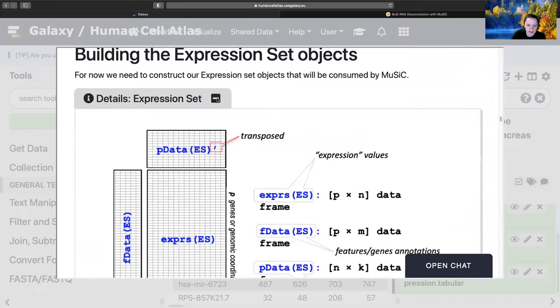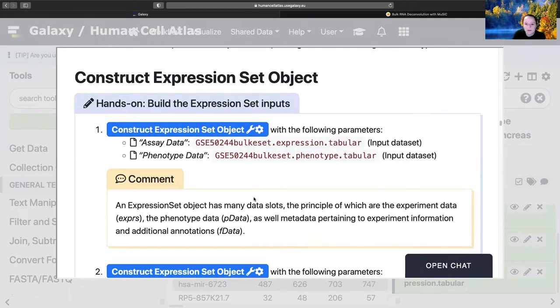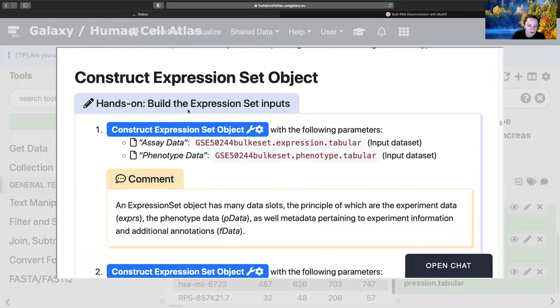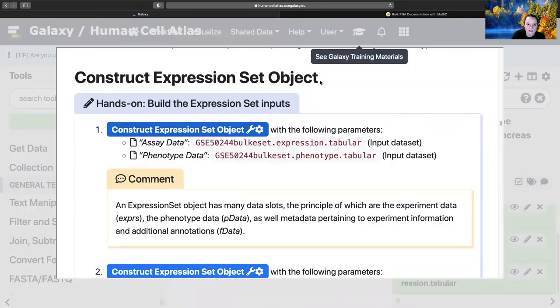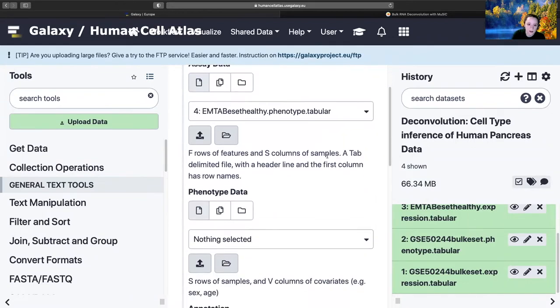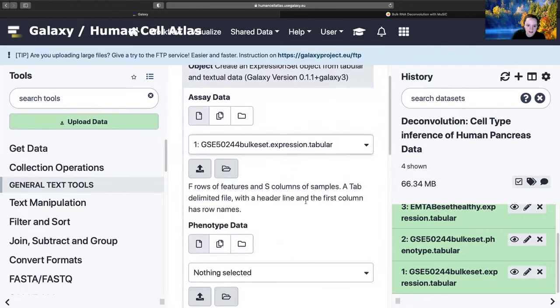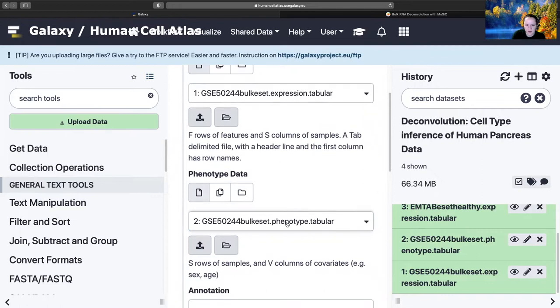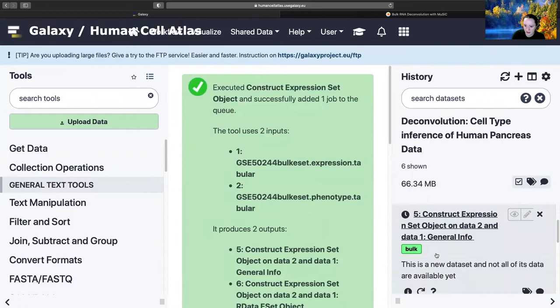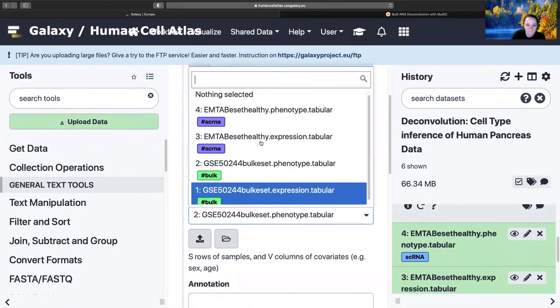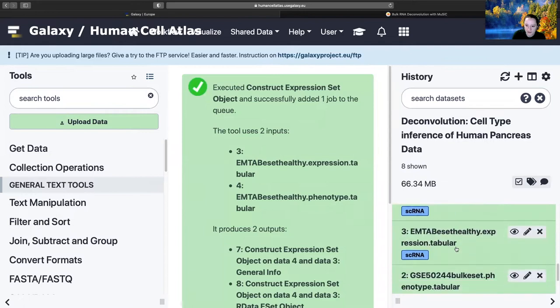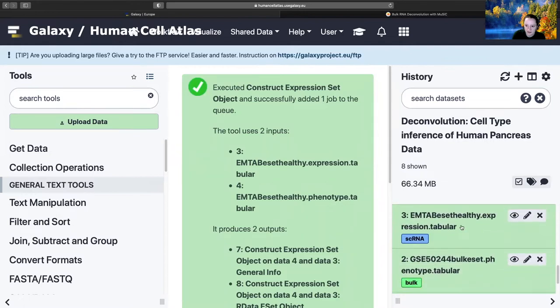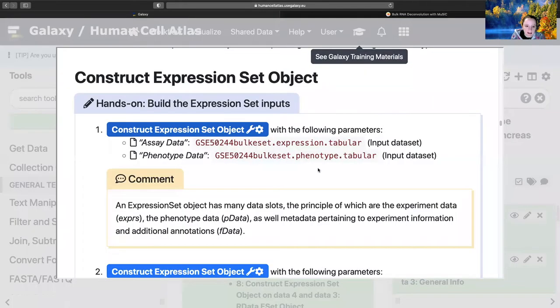The expression set. I hate this about single cell data. It's always like, let's make a new type of matrix that stores all this data. Seurat object, AnnData object, now expression set objects, and Monocle has its own object. Stop it. Construct expression set. And this is why we use the tutorial version, so I can just click this button. We want assay data - that's the expression data. Then we want phenotype data. This is really cool because it's going to carry our tags through, which will be super helpful. And that's all set.